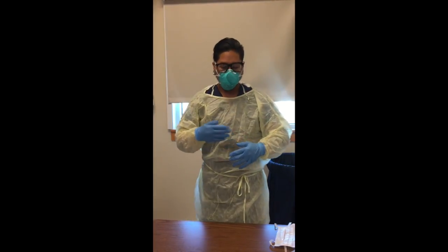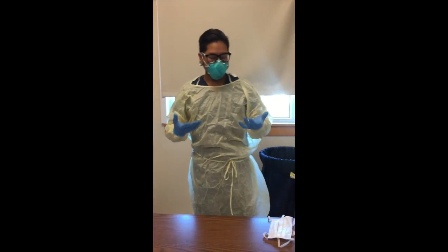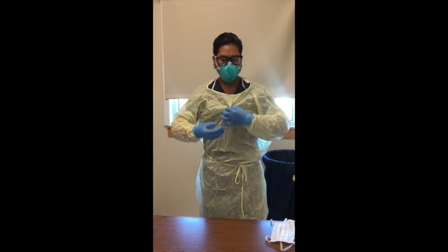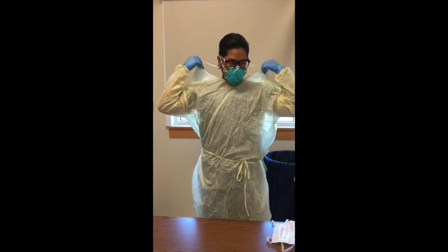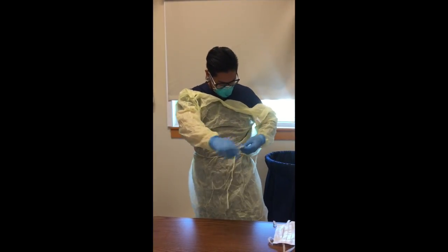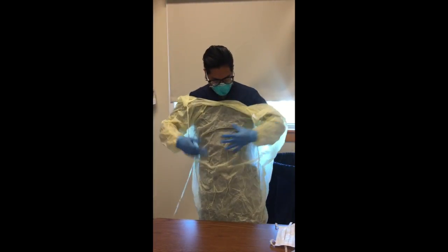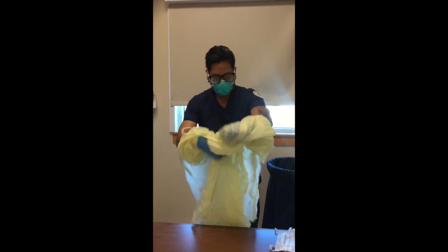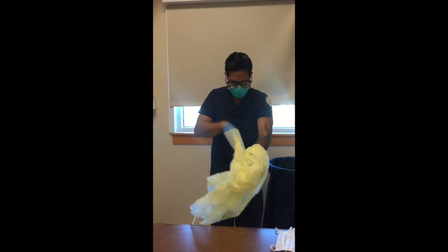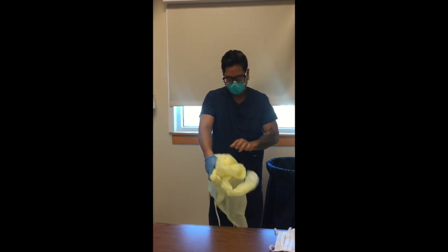So when you go in, you do what you need to do, get it done, and then when you're walking out, the way to take this off, I kind of do it differently because I have glasses on. So usually you take off the gown first, you rip it off, but I'm not going to rip it off. Take it off like this, and then you roll it away from your body, and then I'm going to take one glove off as I'm pulling it away from my body. Dang, no I didn't. Okay. There we go.